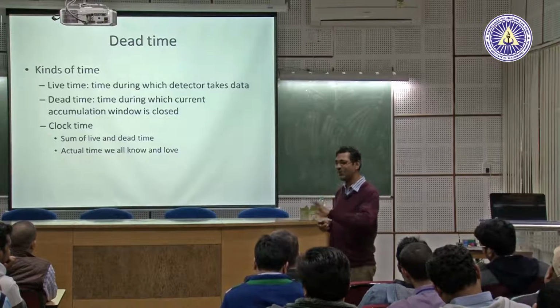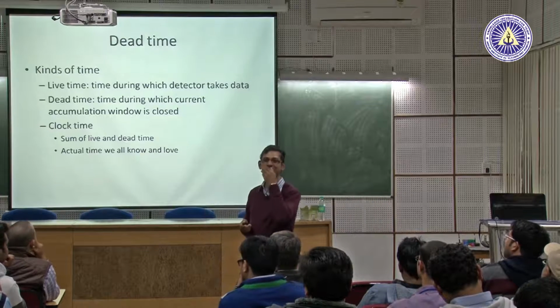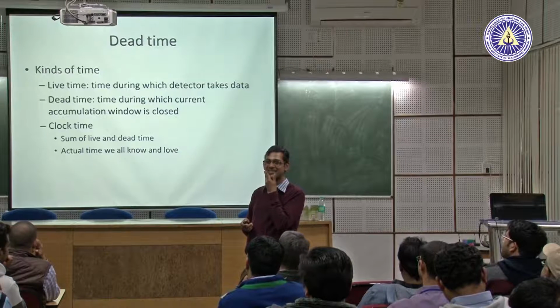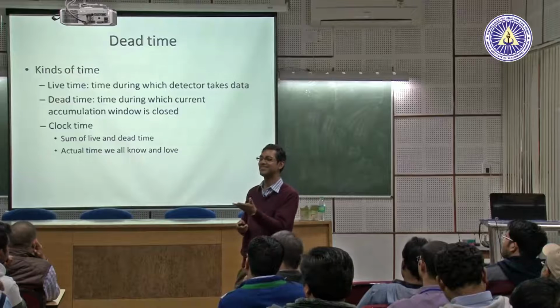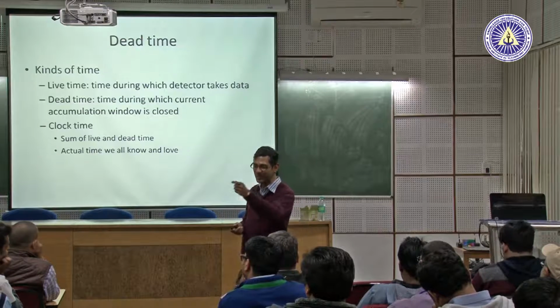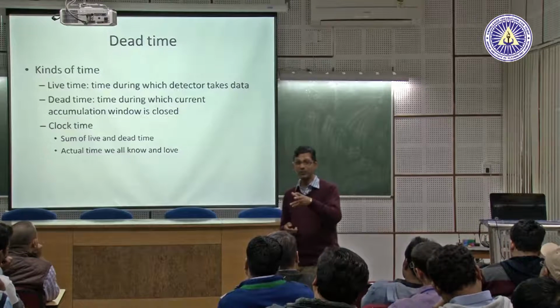You have not read Khalid's book, the chapter on detectors. What is the first X-ray detector? Gas filled. Yes. How does it work? Gas gets ionized, and you measure the current. Now we are doing a solid state detector, right? The same thing. But then what happens?